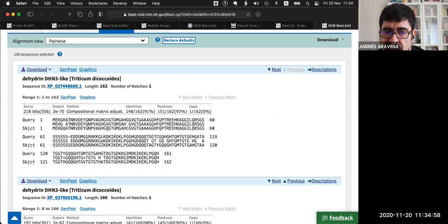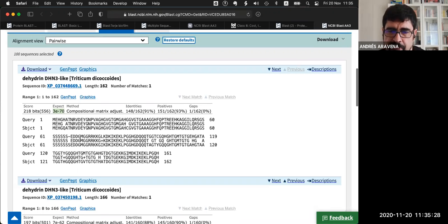What we have here, we have a score, okay? We have an expect value, very small. Being so small, we know that this is not something happening randomly. This is probably something biological. I mean, these are probably related. It's not something that happened by good luck. This is something meaningful statistically.